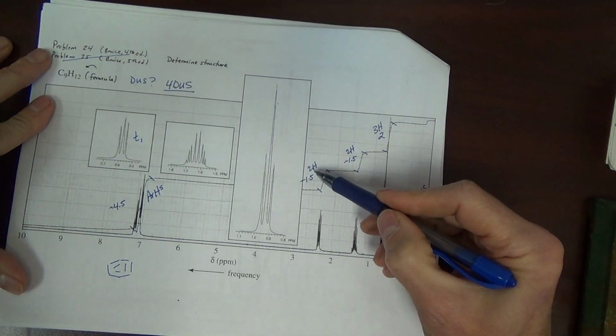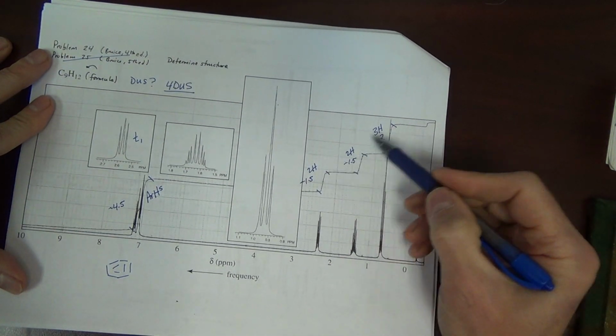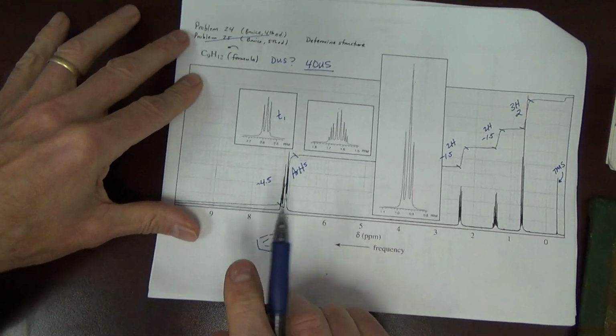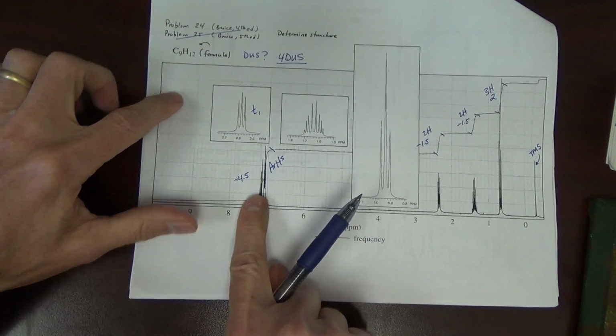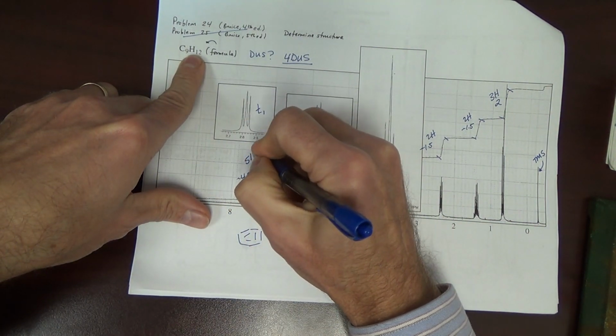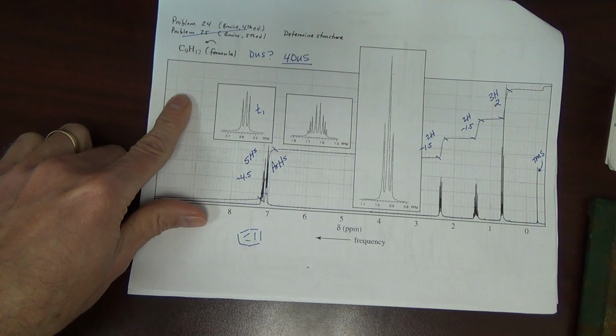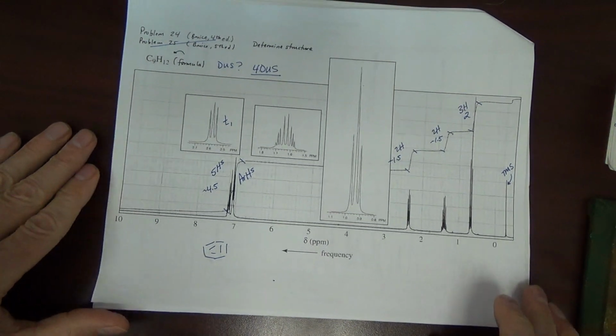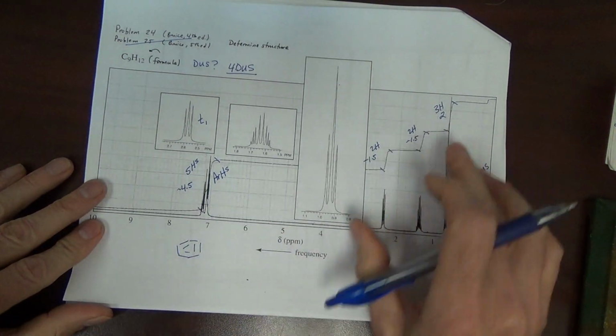And if that's 4 and 3, if that's 7 H's, then this over here must be 5 H's for a total of 12. All right? And I think that indeed is the relative integration.